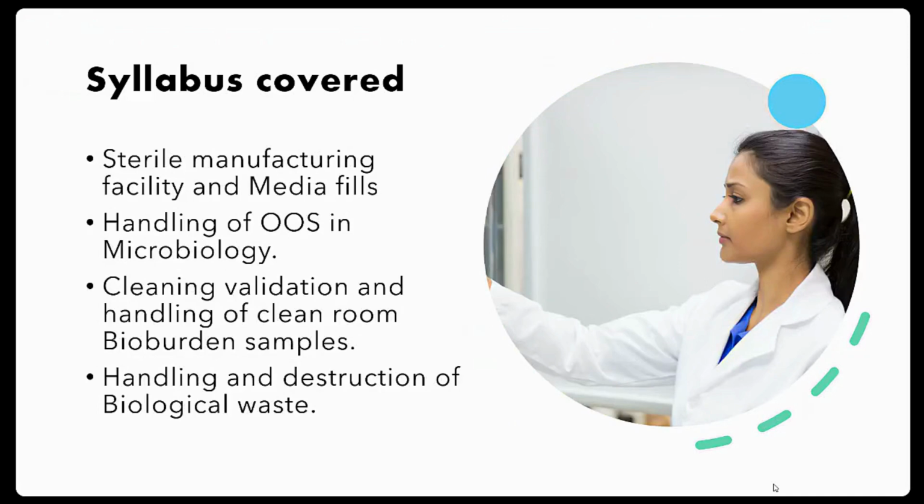Next, sterile manufacturing facility and media fills. Sterile manufacturing facility means the aseptic processing area which is used for manufacturing of sterile products. Media fill, also known as process simulation study, is carried out to assess the capability of the aseptic process. In this chapter, we'll discuss what is the frequency of media fills, what happens if a media fill failure happens, all this we'll discuss.